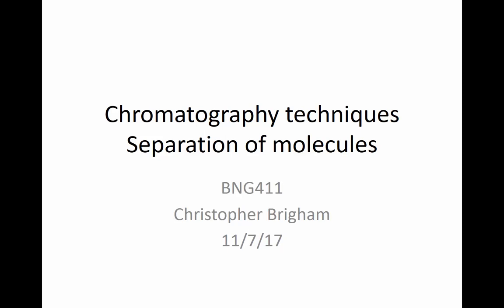This is the pre-lecture. As you know from my email, I am not in this week very much. So I will record the pre-lecture for this week's lab. We're going to do chromatography techniques and separation of different kinds of molecules.